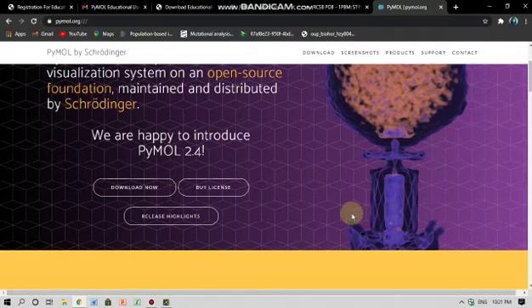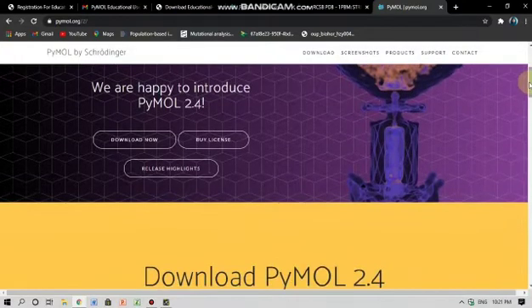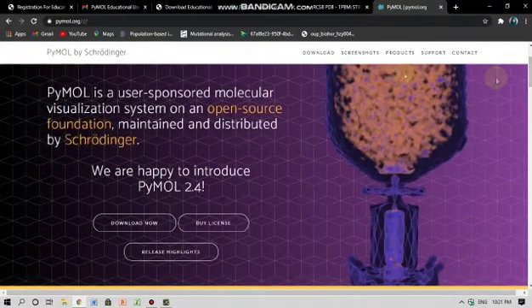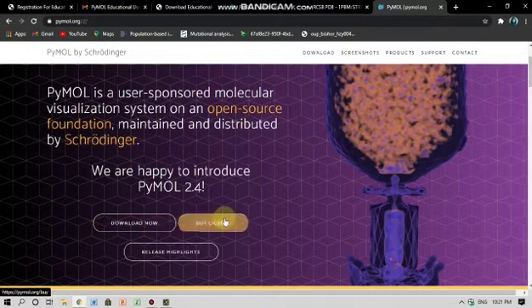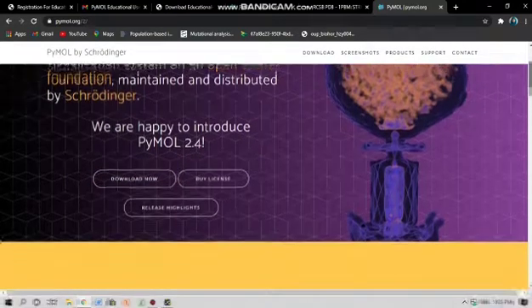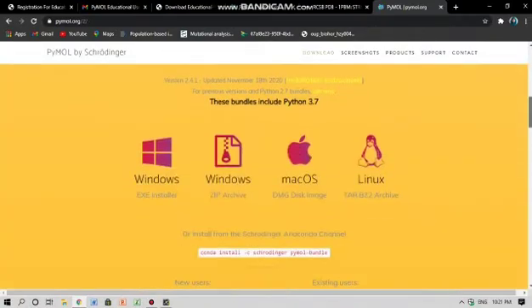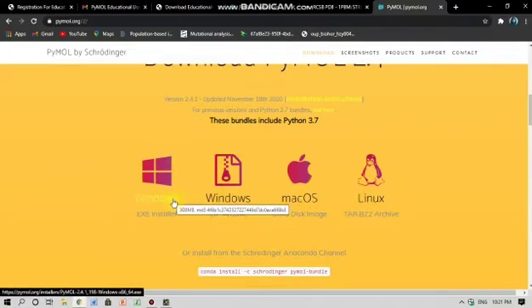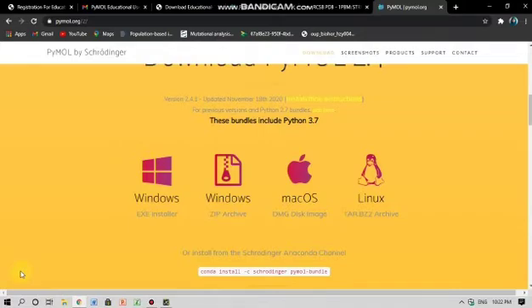If you want to run the free version of this software you can simply download it, otherwise you can also buy the license and perform various other functions as well. You can also go down and see the different operating systems. I have the Windows operating system, so I'll just click here and the file will start to download.